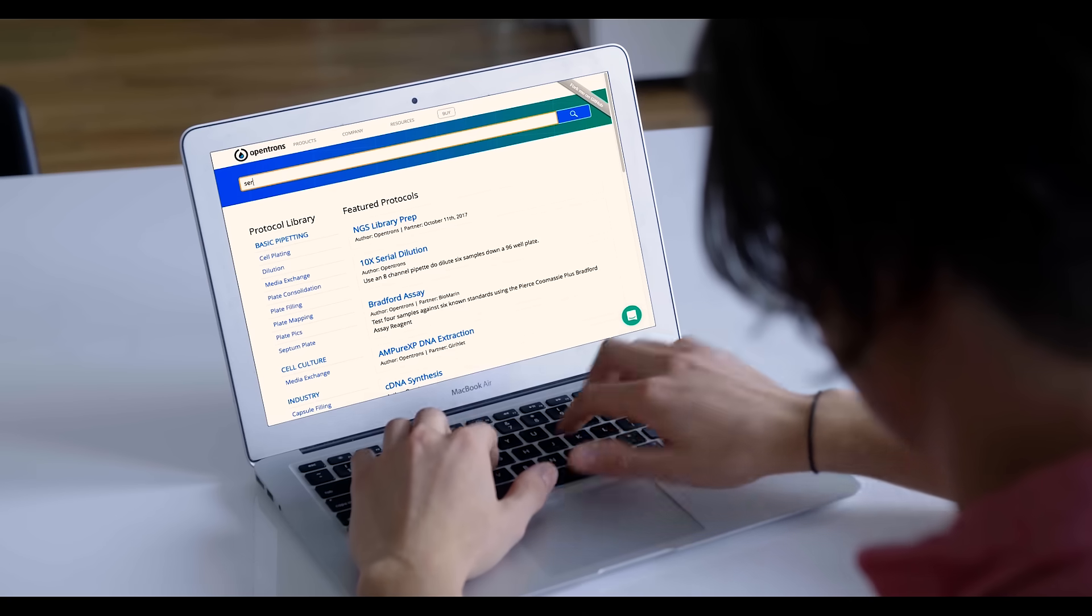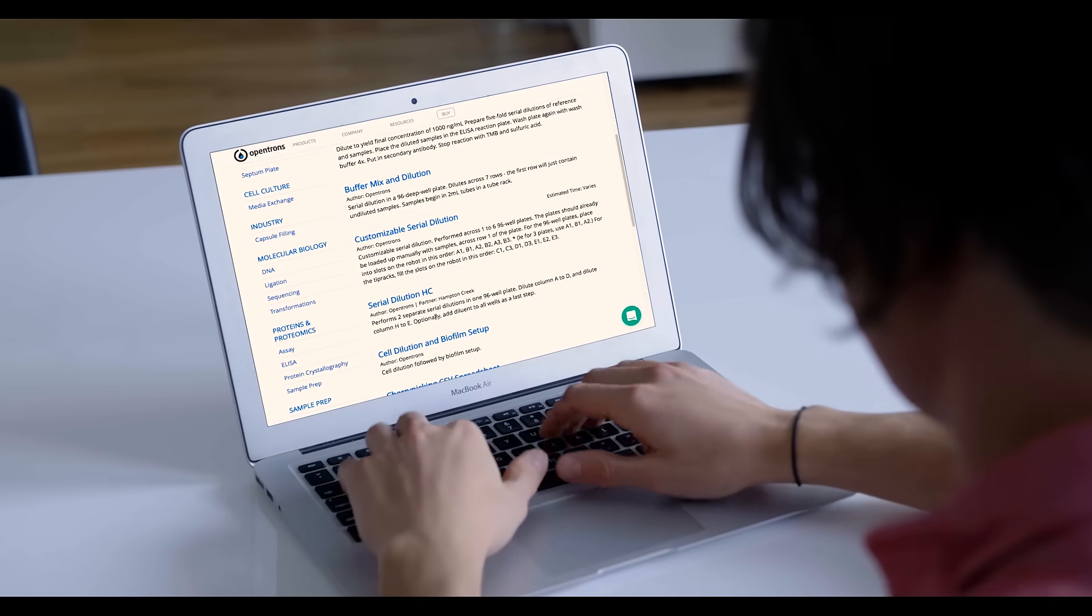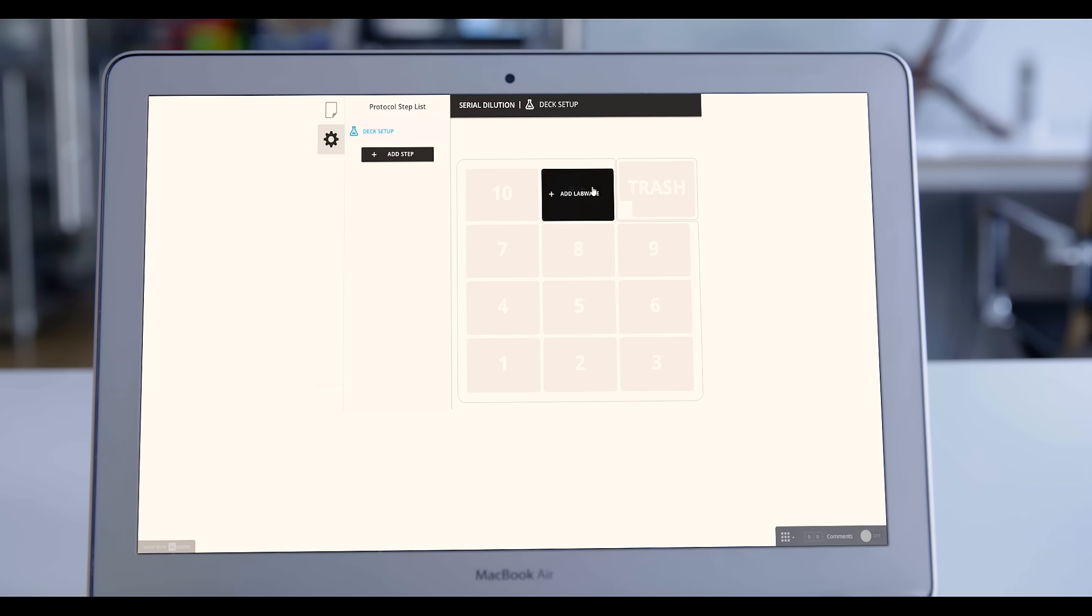You can choose one of the protocols developed by our community and submitted from institutions like Stanford and the Mayo Clinic. Or make your own automated protocol with the protocol designer. The intuitive visual interface makes it easy to create protocols yourself.